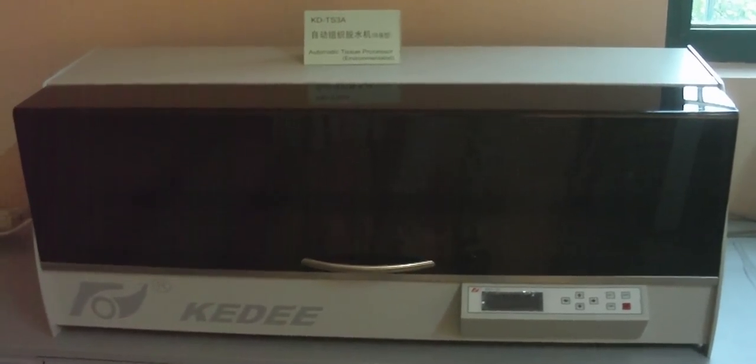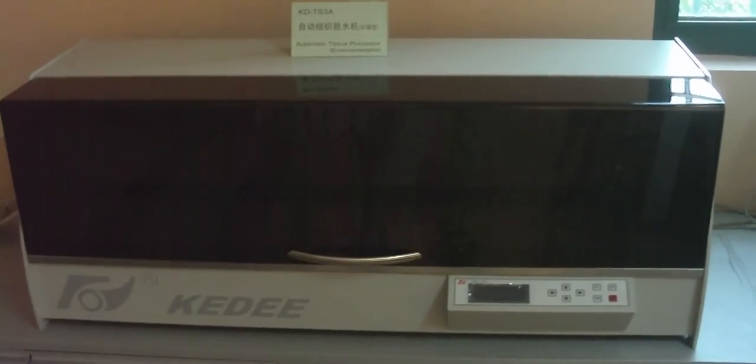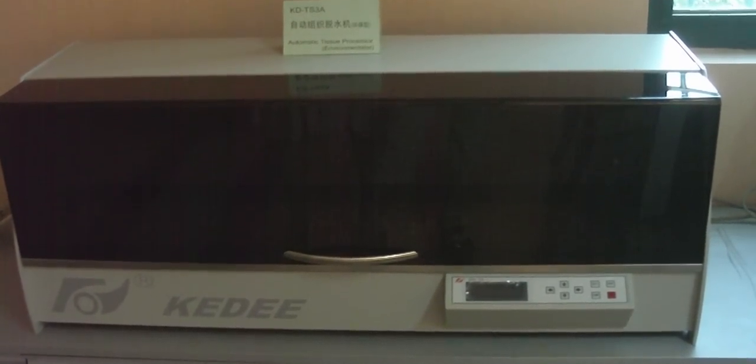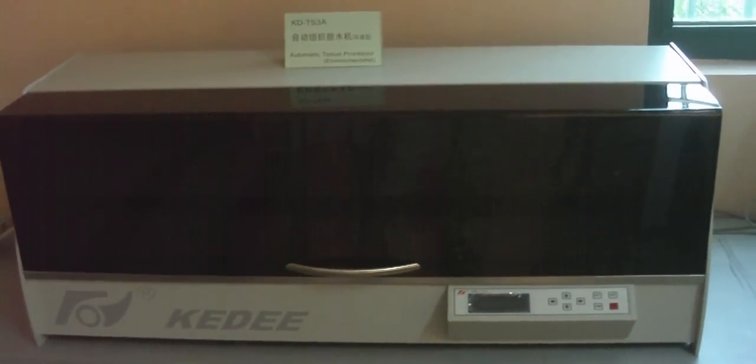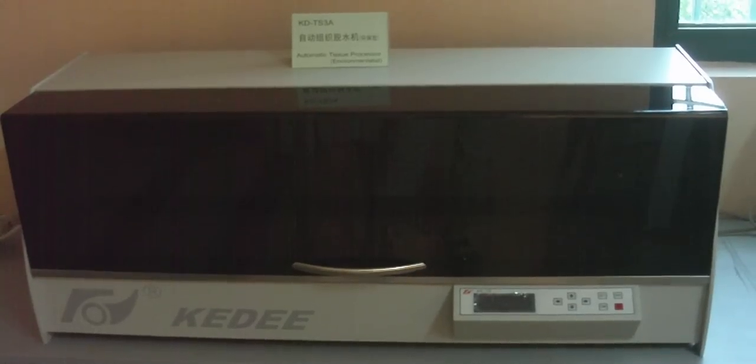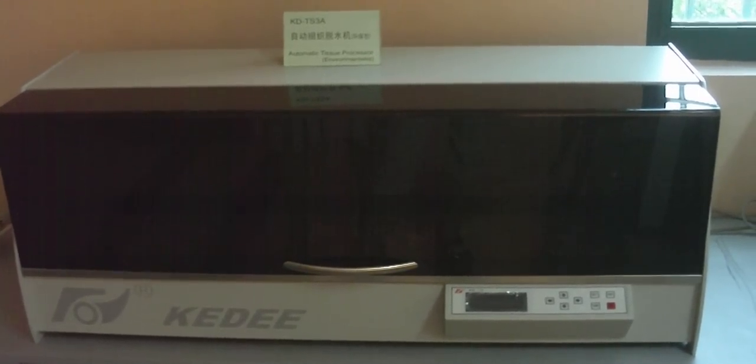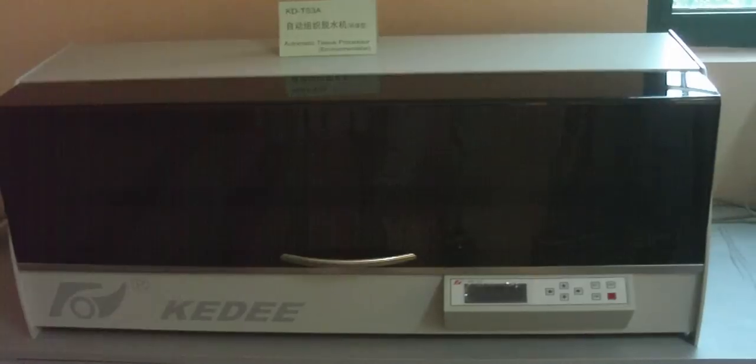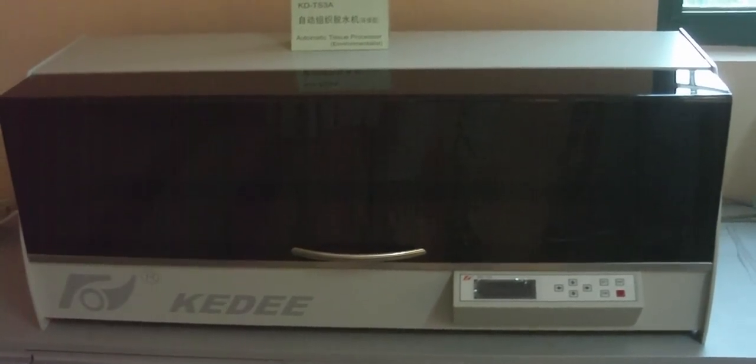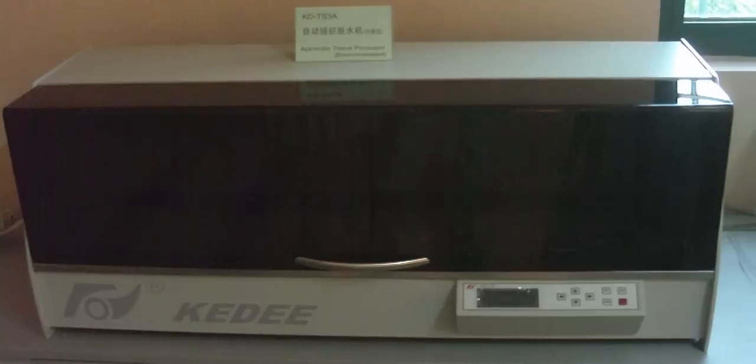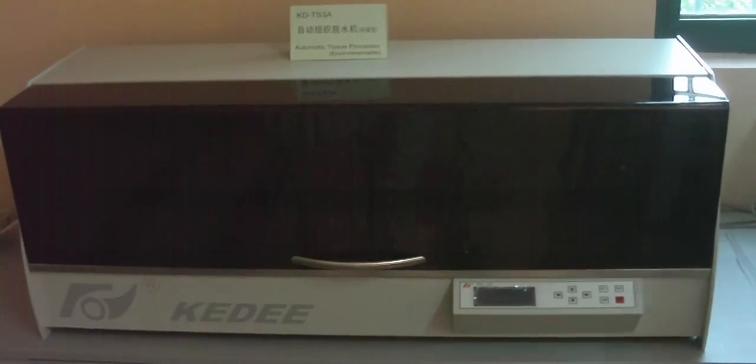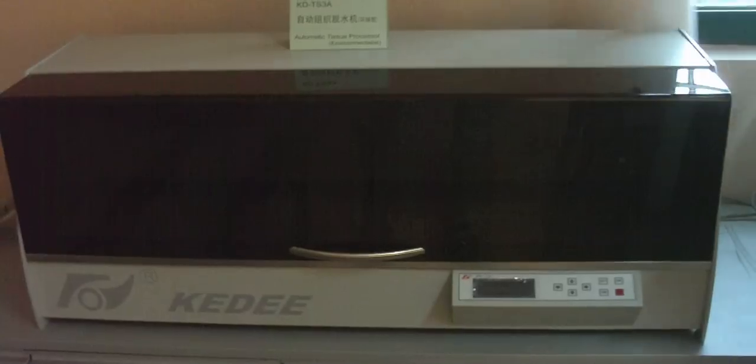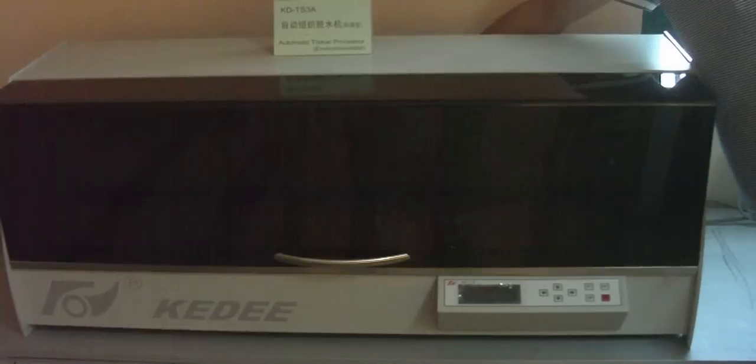Thank you for using KIDI instrument. This demonstrates operation for model KD-TS3A. First, open the package carton and take out the operation manual and accessories. Then take out the instrument, install the exhaust pipe bracket, and connect the exhaust pipe to the bracket.